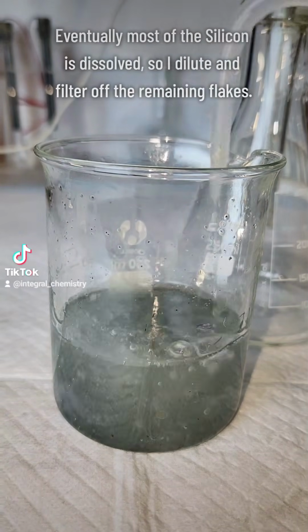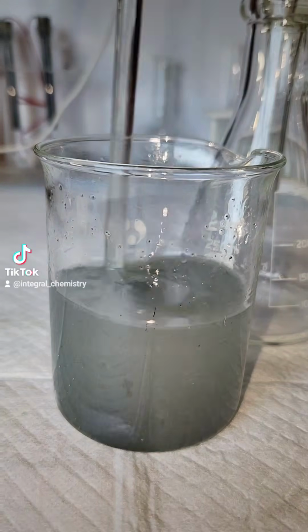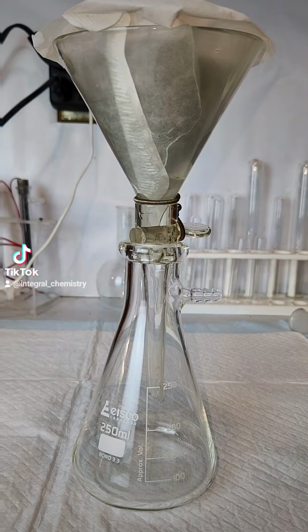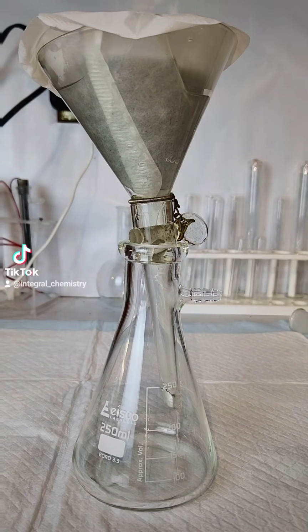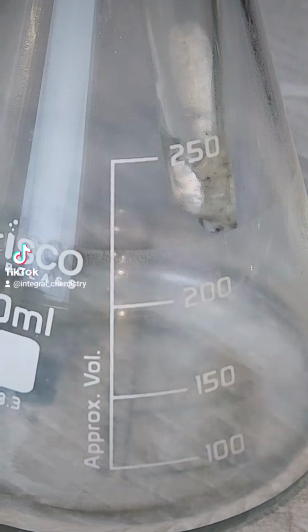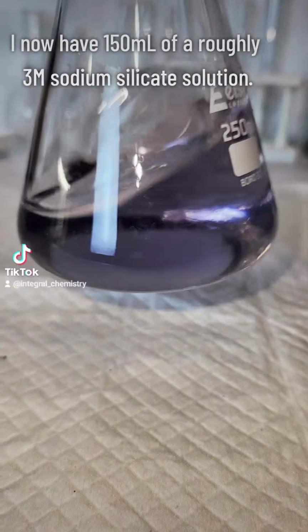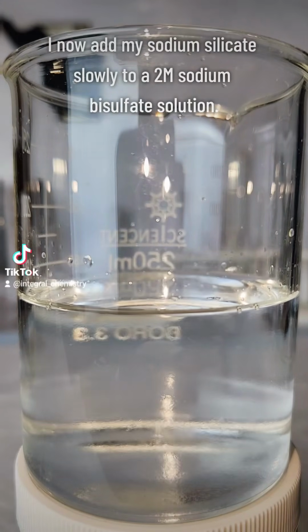In any case, once the silicon is mostly dissolved, I add some water to dilute it so that it won't dissolve my filter, and I pass it through a filter paper to remove all of the larger pieces. The result here is a pure and clean sodium silicate that I can then take and use in the next step of my process. If you look back in the video, you'll see that I dissolved half a mole of silicon. Since my final solution has a volume of 150 milliliters, this is probably around a 3 molar solution.